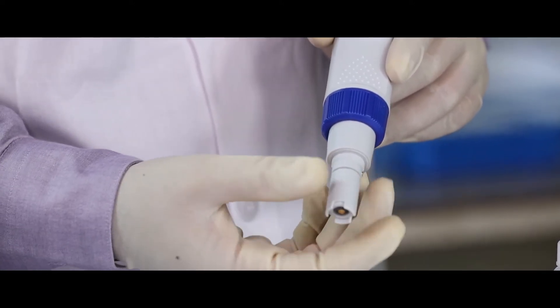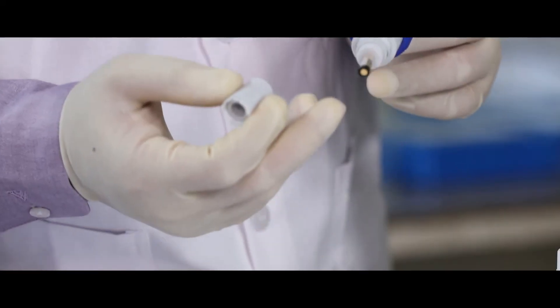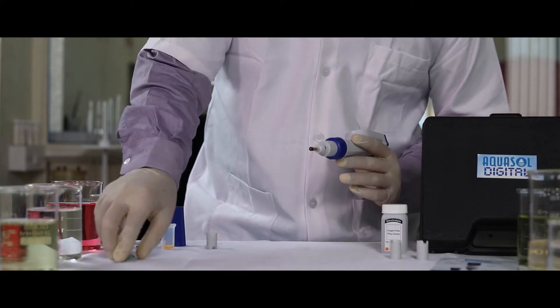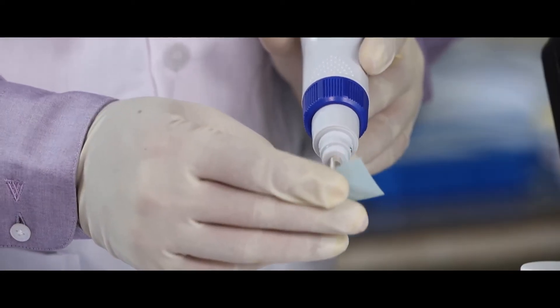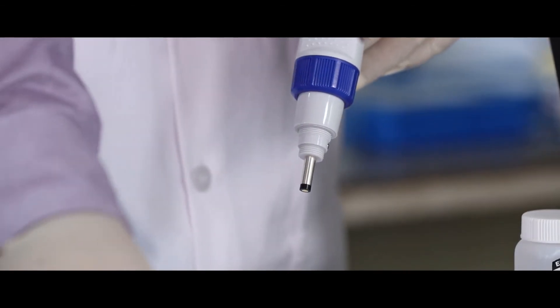Unscrew the membrane cap slowly to reveal the anode and the gold plated cathode. To polish the cathode, use the polishing strip moistened and polish it perpendicular to each other. Do not over polish it.